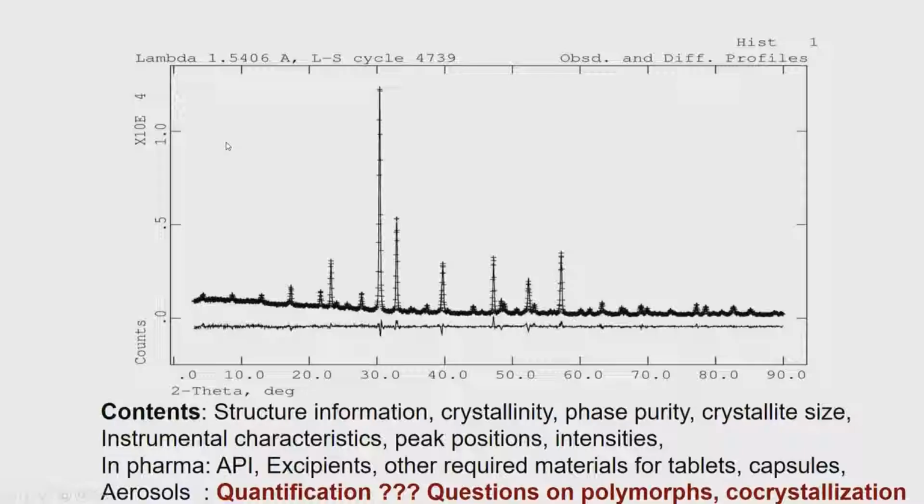As we have been discussing, the x-axis contains all the information that is required of the geometry of the diffraction, and the y-axis contains all the information about the structural aspects. We see a typical XRD pattern shown here, where we have marked the possible peak positions associated with these, and the dashed lines here are the calculated structure factors.